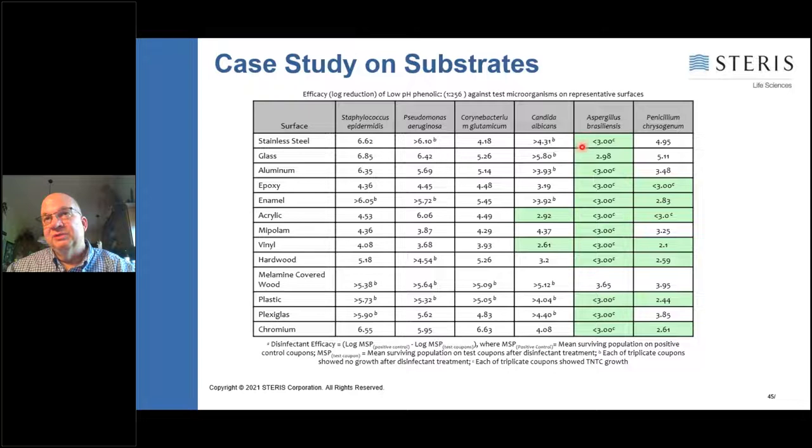That is because some of these molds, like Aspergillus and Penicillium, are harder to kill. Those little spores would require a sporicide to be able to kill them. So that's a key thing to keep in mind.